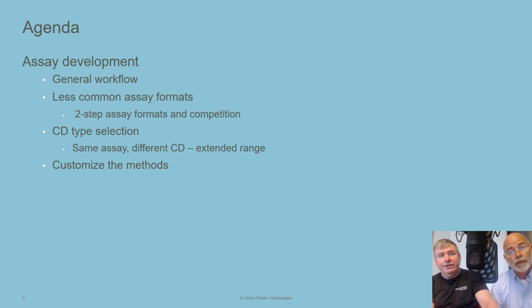Yeah. So today, we want to go through general assay development, the development guide, how you start approaching an assay, things like choice of CDs, methods, etc. And then really how you can customize the method. So we're going to go through this in detail today.